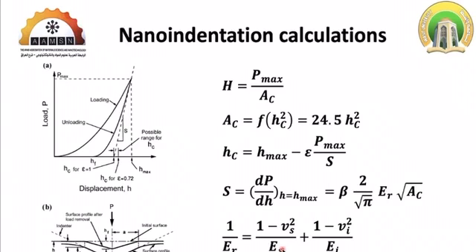I'm just going through the theory of the machine very quickly, without derivations or all this mathematics.